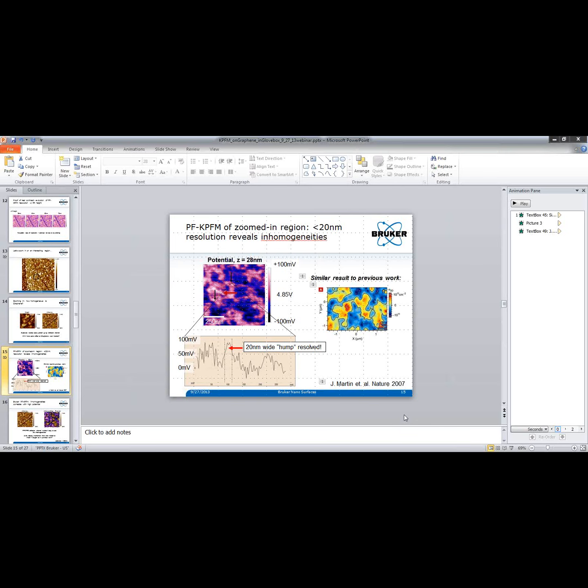Okay. So we actually have quite a few other questions, fairly detailed on the setup. But in our last 5 minutes, to make sure we get some from each of the 3 categories, I'm going to switch over to questions that are about next steps. And so a question here is, did you try manipulating the charge puddles around by pressing down with the tip? Joe Lighting recently reported similar STM images where the inhomogeneities were attributed to trapped water, and it doesn't go on, but ostensibly was able to affect them with force.